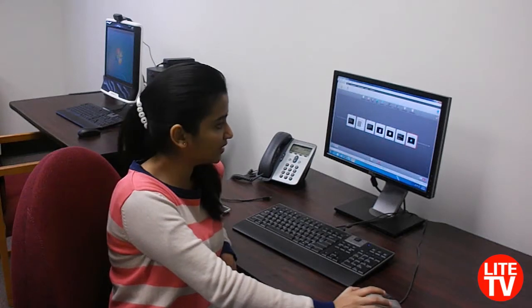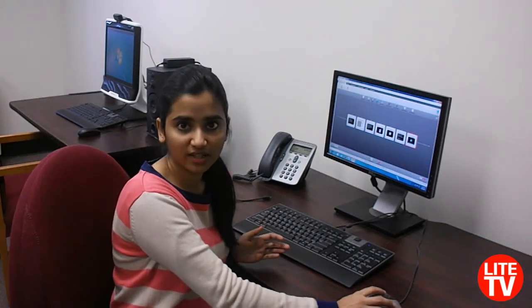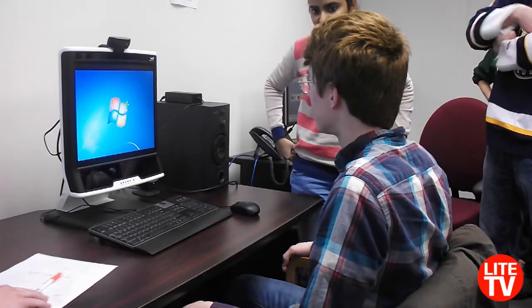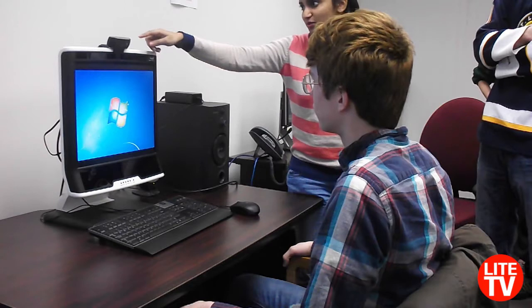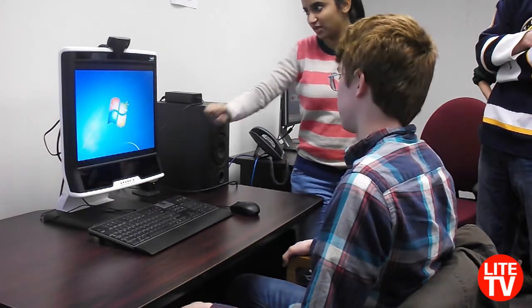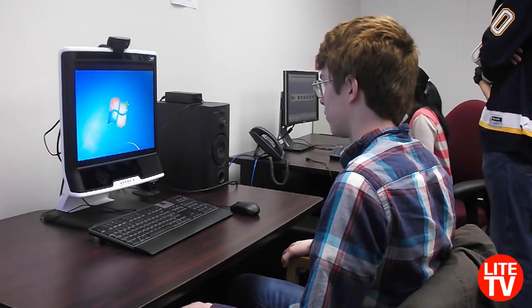So that's how simple it is to set up an experiment for a research or any kind of project in the Tobii software. Somewhere over here, which will actually track your eyes. And sometimes you can also switch on the camera, but right now it's not on. Yeah, so this is just for the eye tracking. I'll go ahead and start recording.